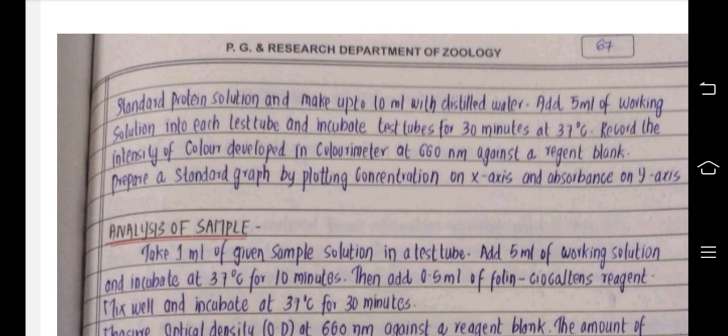Record the intensity of color developed in colorimeter at 660 nanometer against a reagent blank. Prepare a standard graph by plotting concentration on x-axis and absorbance on y-axis.